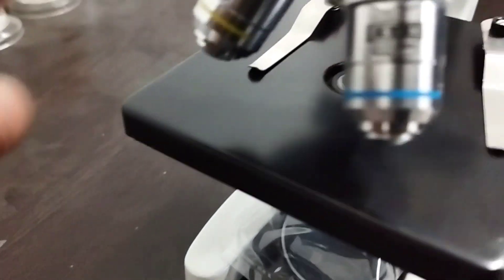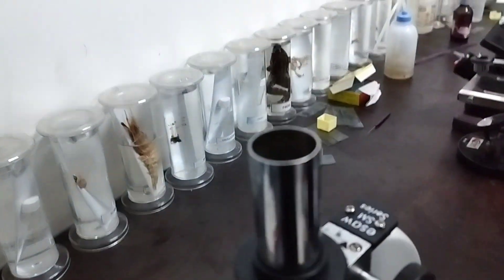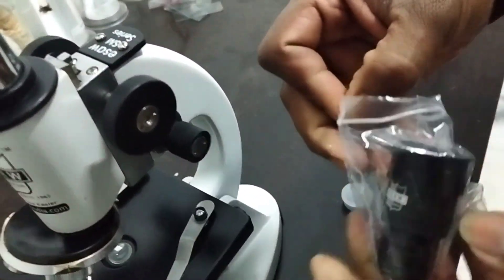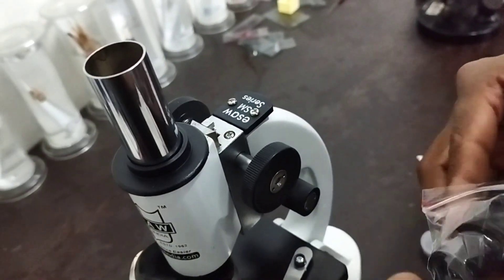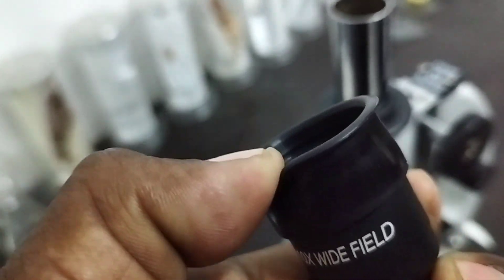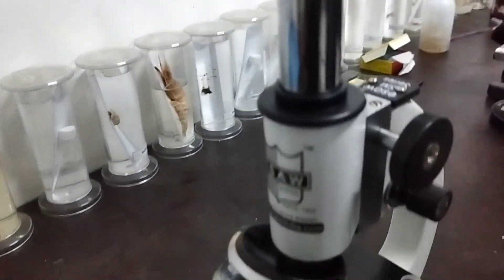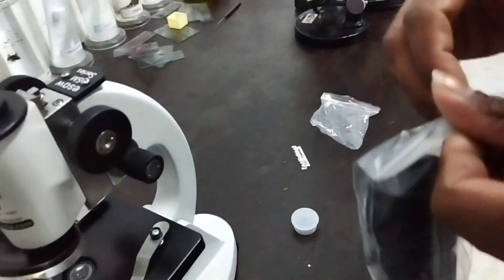Two objective lenses are provided — I think this one is 10x and this is 45x. We need to fit in one eyepiece lens. We are going to attach the 10x eyepiece lens. Okay, eyepiece lens attached! This is a light — an artificial light source. Let's open it.